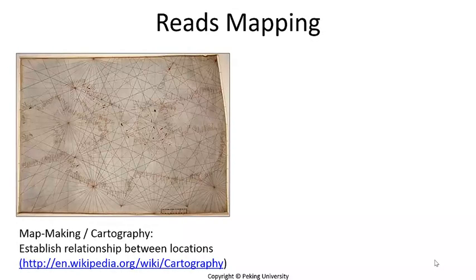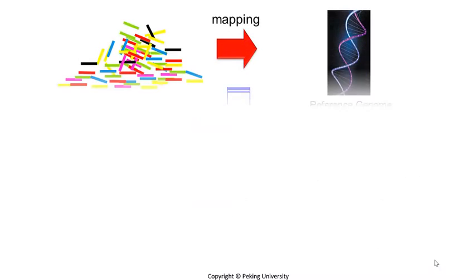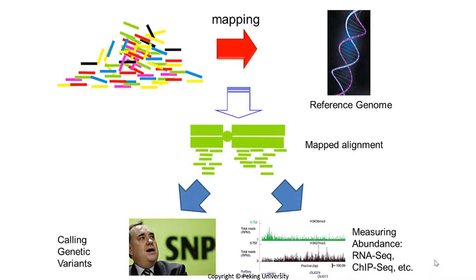In the last unit, we introduced the deep sequencing technology, its highlights of performance and typical applications in biology studies. In this unit, we will start with reads mapping and introduce the common bioinformatics methods applied in deep sequencing data analysis. As the name suggests, reads mapping refers to mapping DNA fragments produced by sequencing, i.e. reads, to the genome.